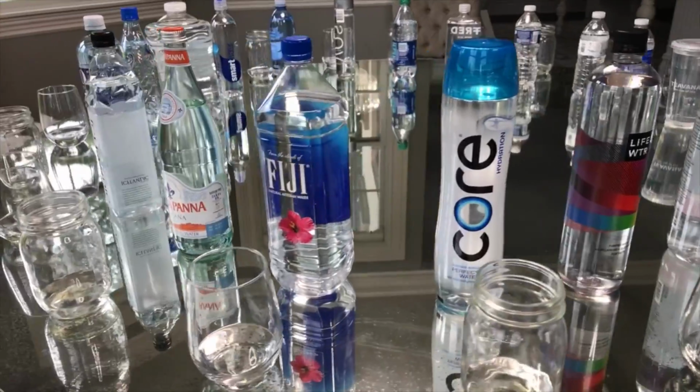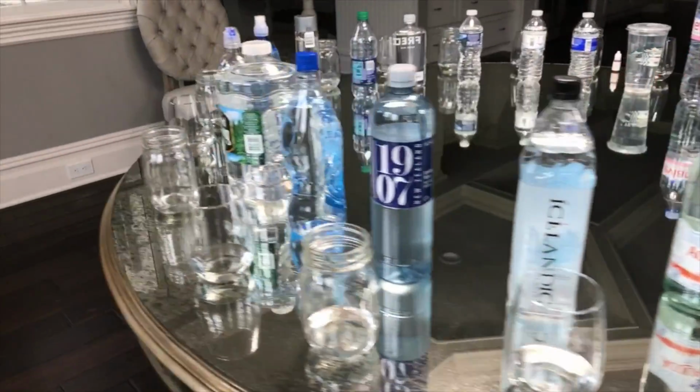What's going on, guys? I've been waiting a long time to do a video like this. I'm gonna be testing the pH of certain bottles of water. I'm also gonna do some tests on the house water we have here. So I went out and bought as many of those delicacy type waters as you can get. We're gonna test them to see if their labels match the pH level and see if they're either bullshitting or telling the truth. What I'm gonna be using to measure the pH level of this water are drops.